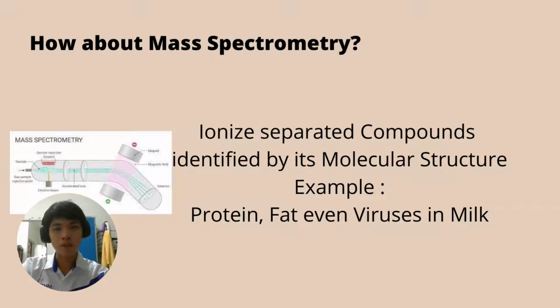Then how about the mass spectrometry? The mass spectrometer ionizes the separated compounds from the gas chromatography and identifies them by their molecular structure.